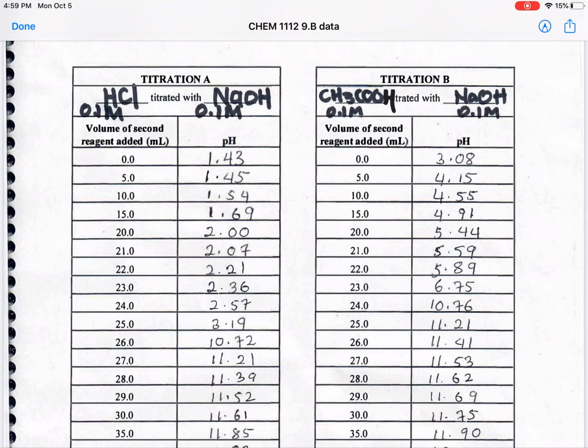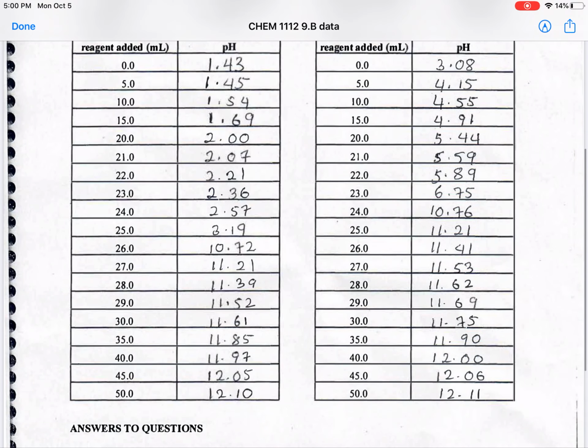and then from 20 to 30 you're going to be adding 1 milliliter increments. Okay, so you can see the pH increases 3, 4, 5, 6 and 10. So between 6 and 10 there is a 4 pH unit difference. So that is where the end point happens, on the little bit basic side, since we are with a weak acid. And then as we keep on increasing the sodium hydroxide, you can see the end point is reached and then the solution becomes basic.